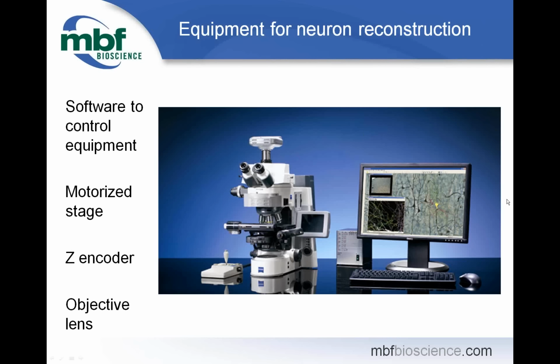A Ludl XY motorized stage will be controlled via a joystick and the live image feed will be sent to the monitor with an Optronics MicroFire CX9000 camera. All the hardware will be controlled by version 9.10.1 of Neurolucida. We recommend using a computer equipped with the latest version of Neurolucida and dual monitors.